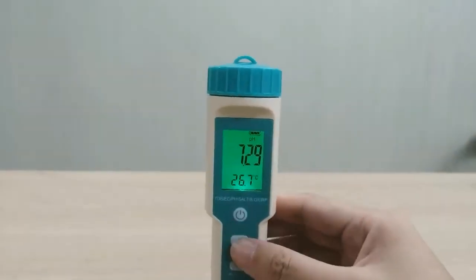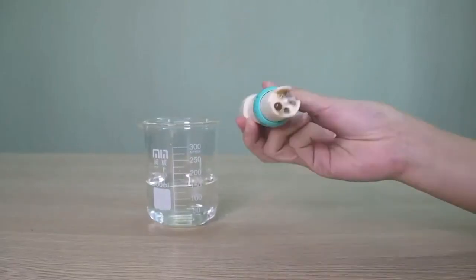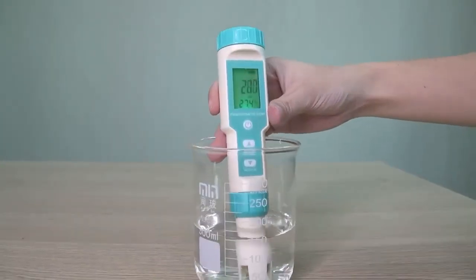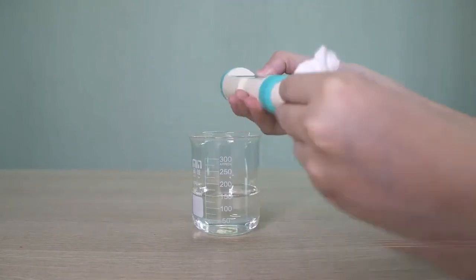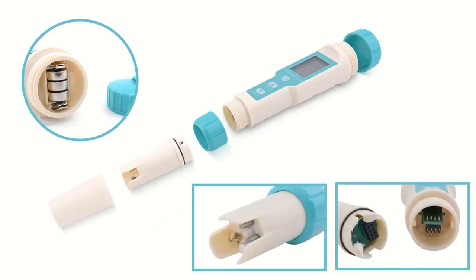It is suitable for home, swimming pool, and drinking water. It has a data hold function and low battery indicator. The waterproof rating is IP67. It features a large LCD display with nightlight design, automatic temperature compensation, and automatic calibration. The probe can be removed.